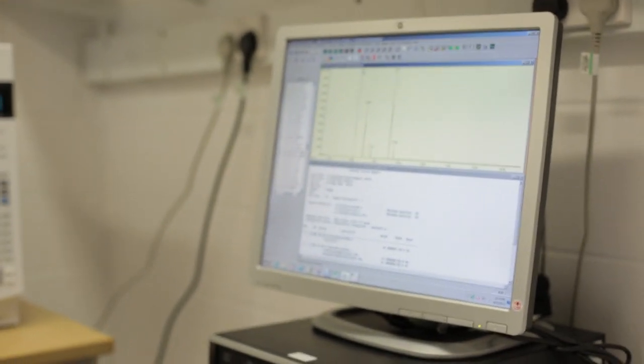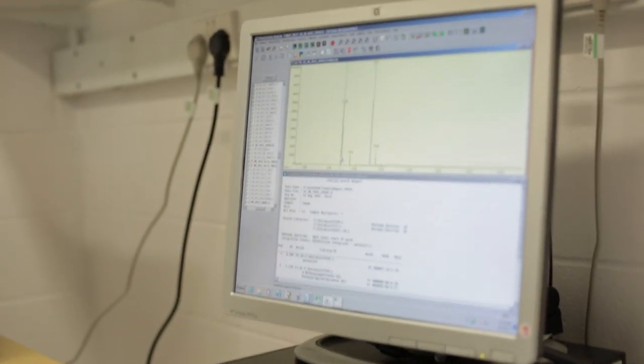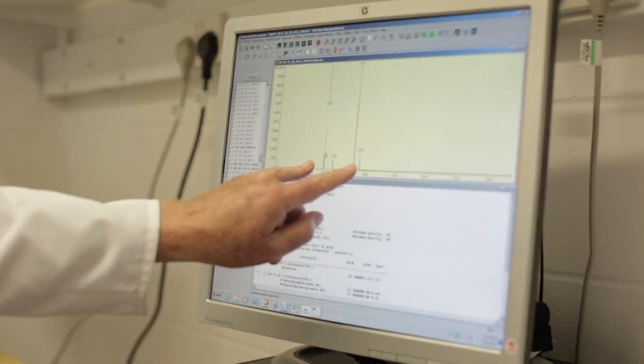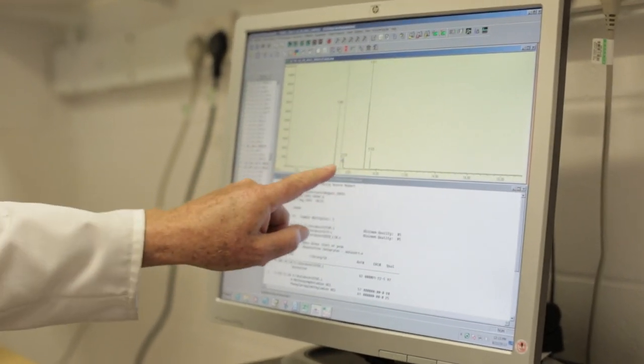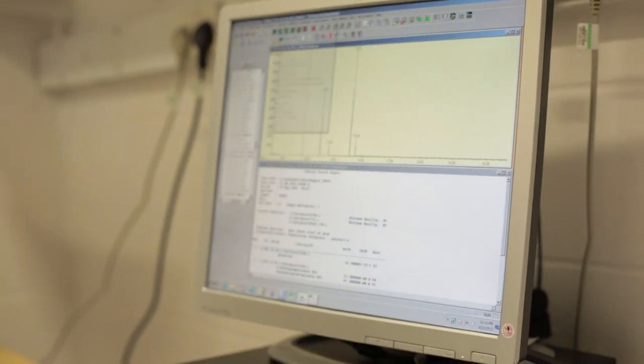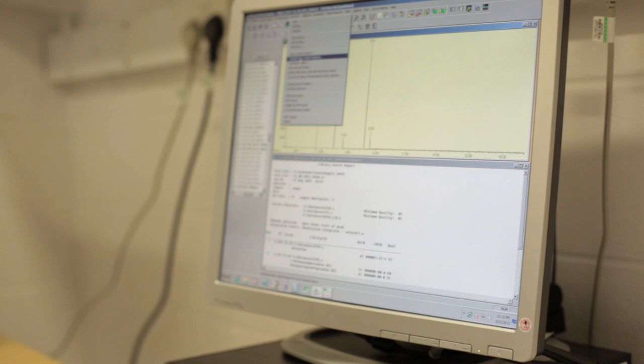So now it's taken 19 minutes for the chromatogram to run, so now we can look at the results. And what we have on the computer screen is the chromatogram which shows the components of the mixture. We add two internal standards so we know what these compounds are, and these are the two peaks of interest. And we can get the computer to search its library to tell us what they are.